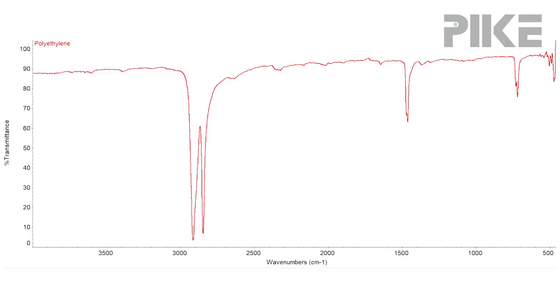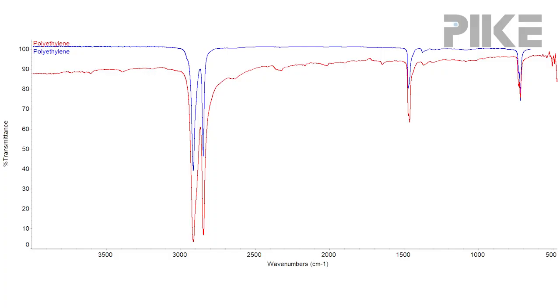We're going to flip that over in transmission because it's a little more recognizable. You can more easily spot this sloping baseline and also this offset from 100%. Now if we compare it to a good spectrum of polyethylene collected with the same accessory, you can see we're right at the 100% line and the baseline is straight.